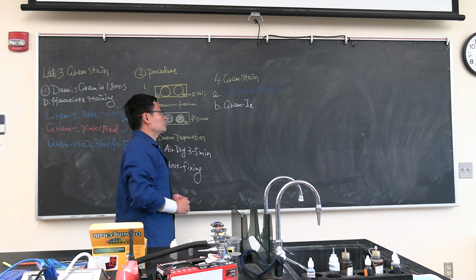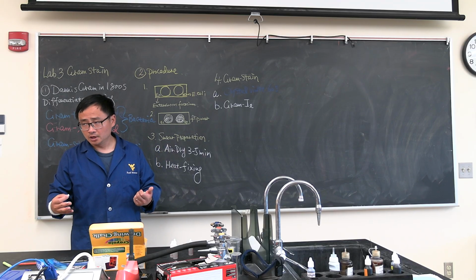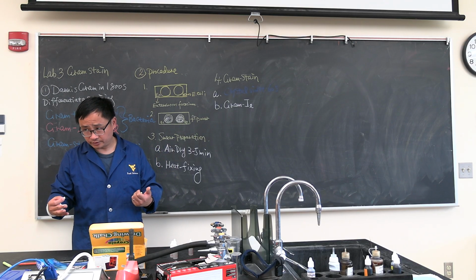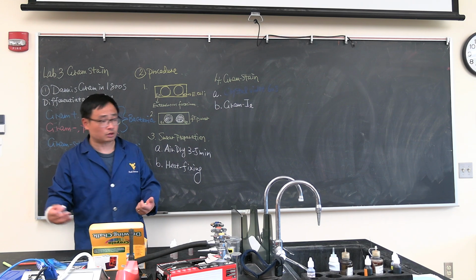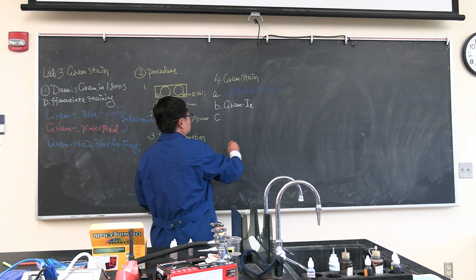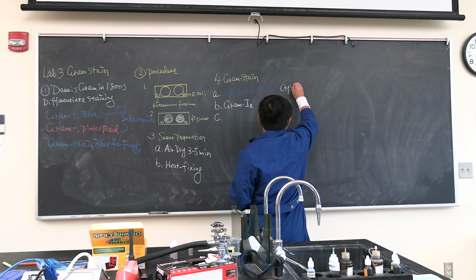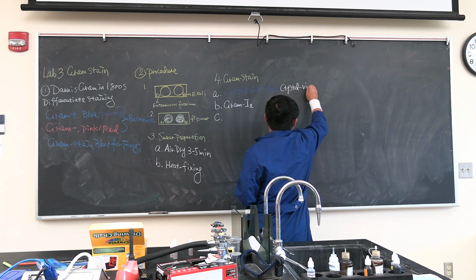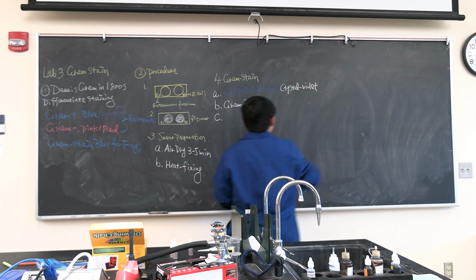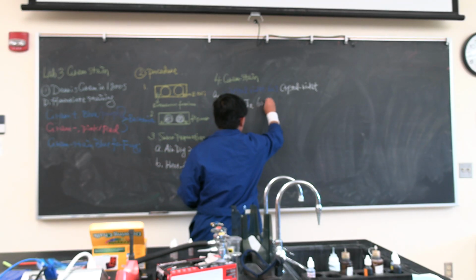So we mentioned crystal violet is a basic dye we put on the bacterial cell, and the gram iodine is a mordant to make the staining strong. Okay. So gram iodine, this is also 60 seconds.